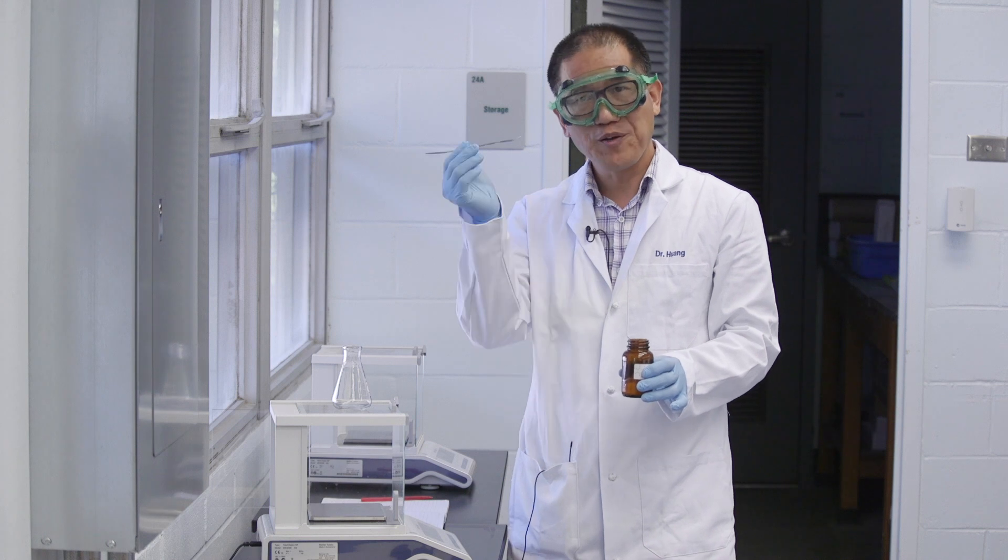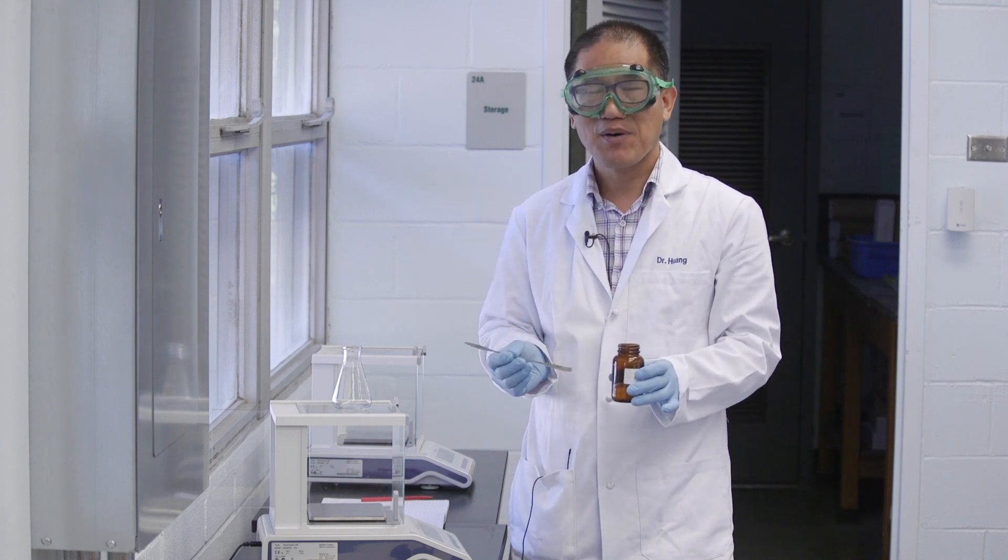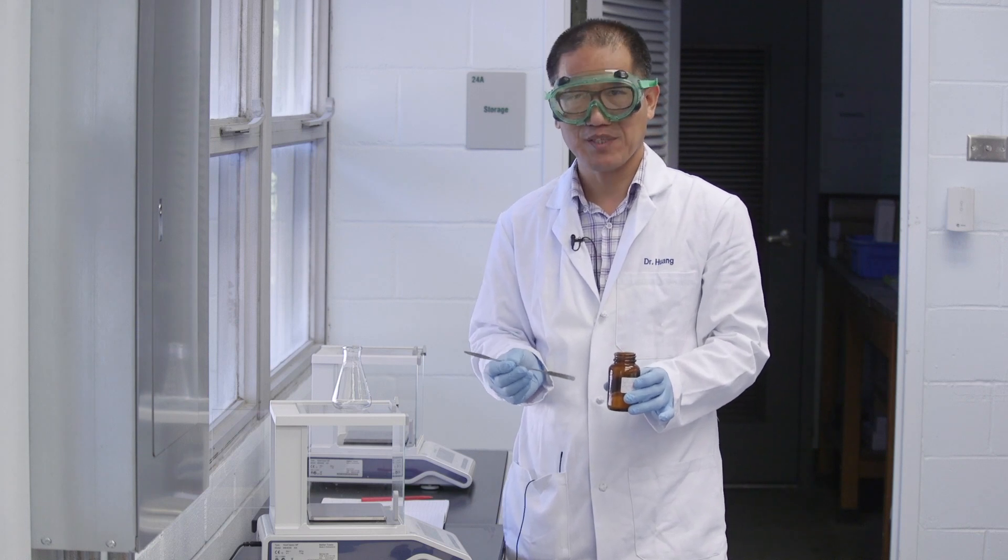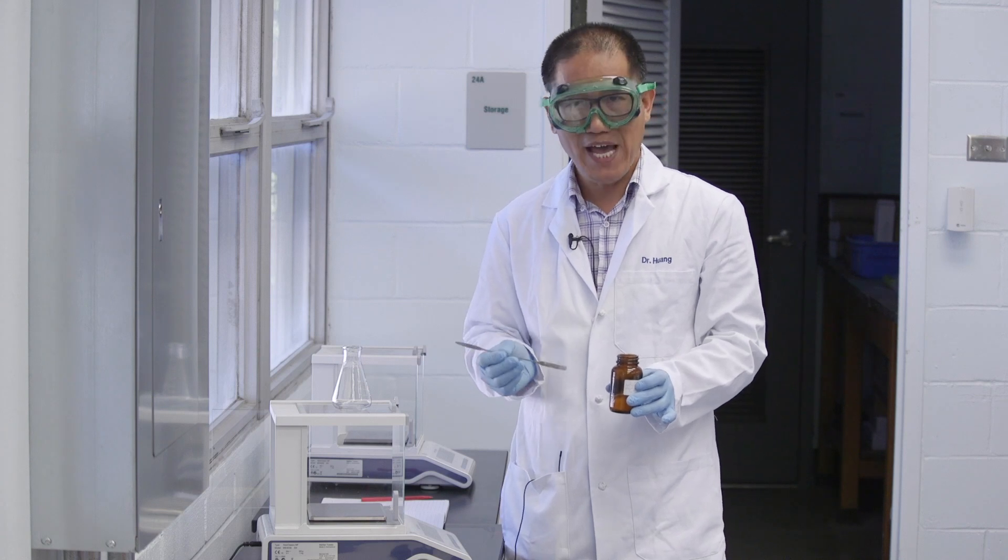We will use a scoopula to add KHP to the Erlenmeyer flask. But the problem is we don't know how much is 0.2 grams. The strategy is we add a tiny amount and get the mass.